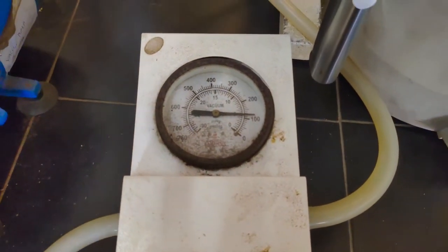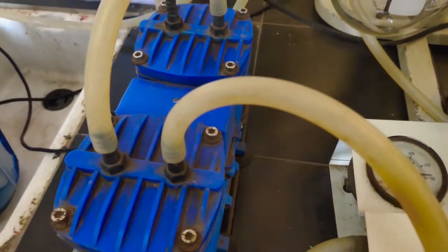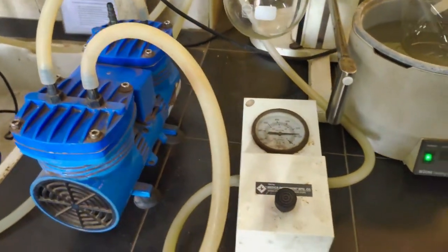The pressure gauge is used to monitor the vacuum inside the flask. The vacuum is supplied by this vacuum pump.